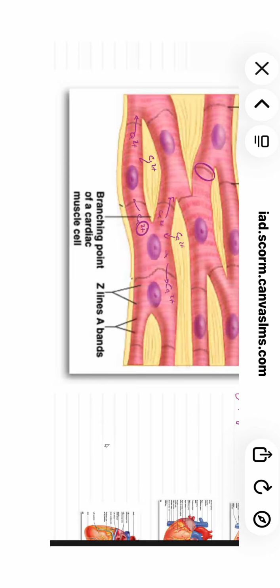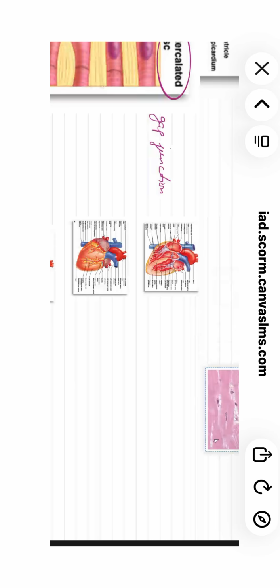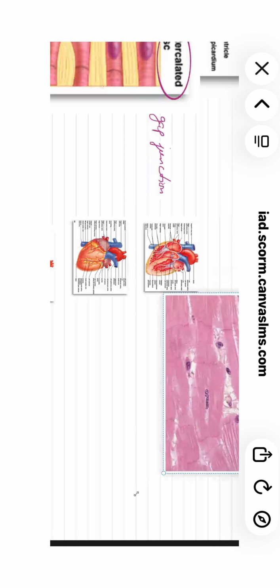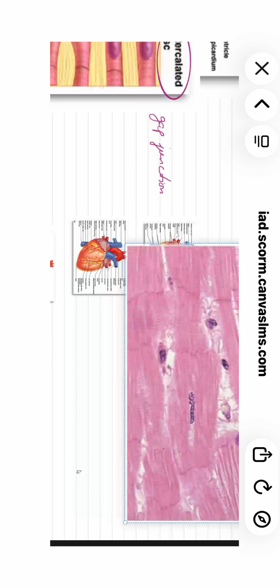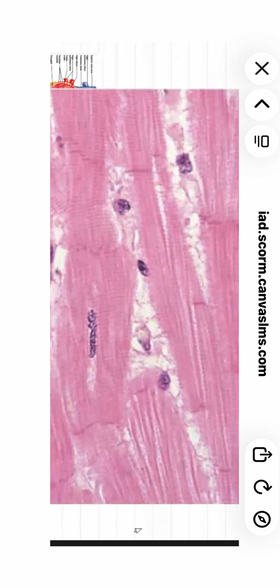All right? While we're here, though, check this picture out. This is pretty cool. This is a simple compound-like microscope image, but this is actually of a hypertrophied heart, where a heart is enlarged because of overuse, if you will. It's like any muscle, it's going to grow, you have hypertrophy. But that's the bad thing in the heart. That means the heart is working harder than it has to. Something's impeding function, blood pressure issues, and so the heart has to work harder than normal to keep up with the demands of the body. So unlike exercise, this is actually an exaggerated function.